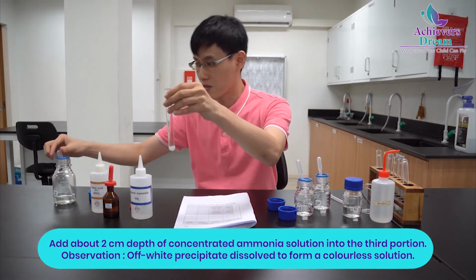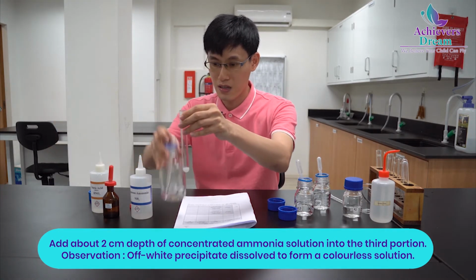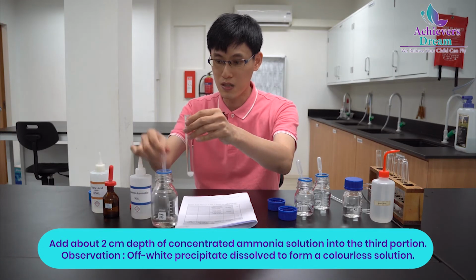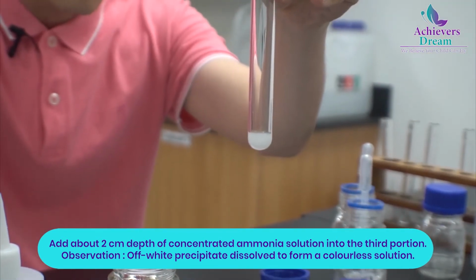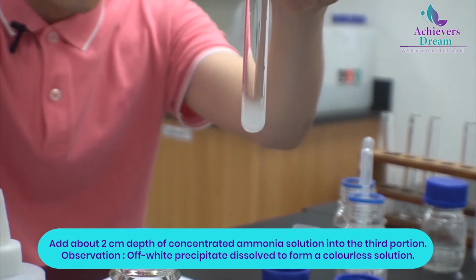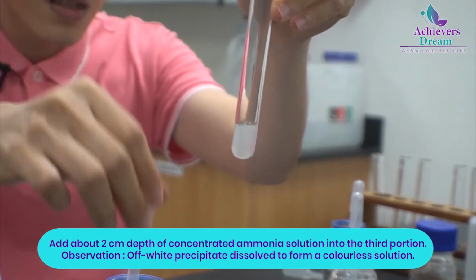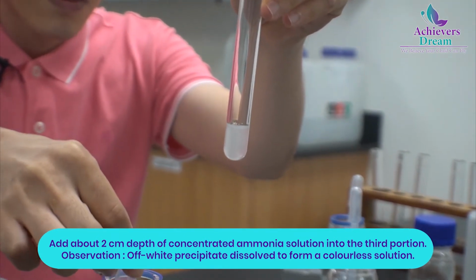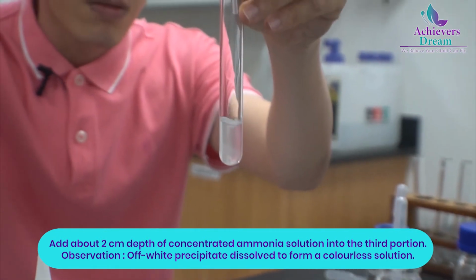But how about concentrated? Let's try. Now I'm going to add some concentrated ammonia now. Ooh, the smell. Okay, let's try. Can you see? Some of the precipitate is already dissolving. Whoa, look.